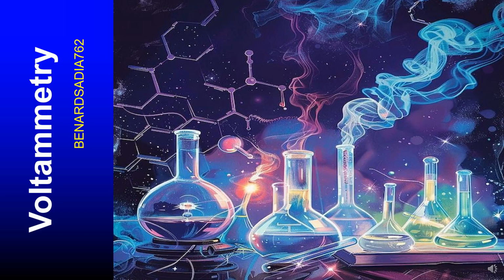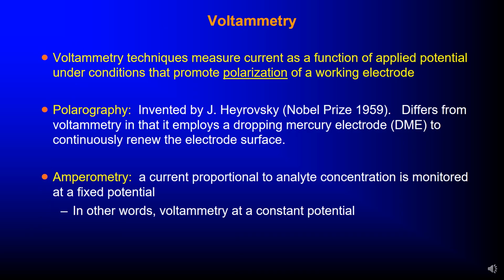In today's class, we are going to talk about voltammetry. Voltammetry experiments investigate the half-cell reactivity of an analyte. Voltammetry techniques measure current as a function of applied potential under conditions that promote polarization of a working electrode.